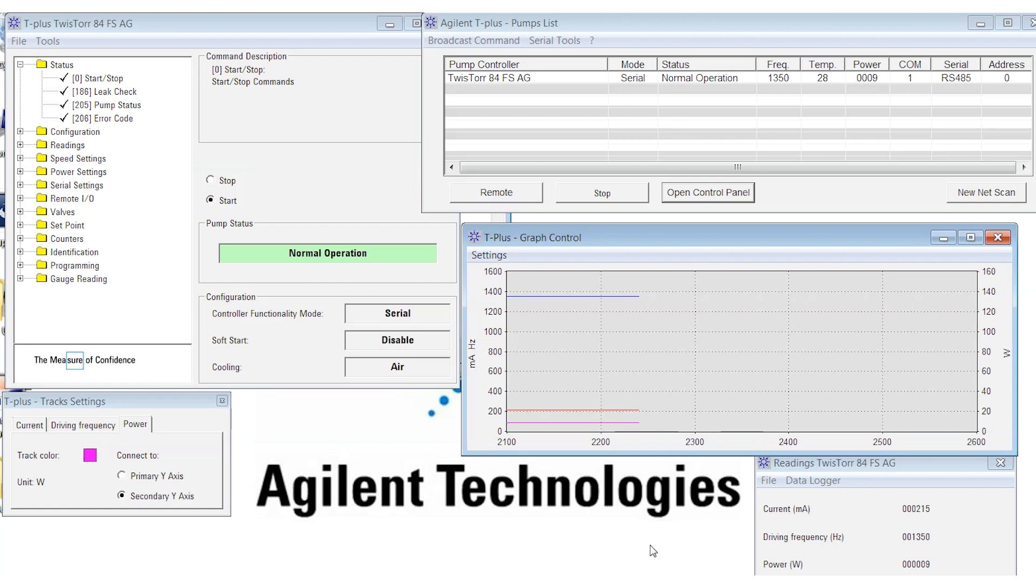Now, if this was a controlled experiment, I could add these parameters to a data log so that I could export them later into Excel for further data analysis. But for what we are doing today, just the live display will be fine.